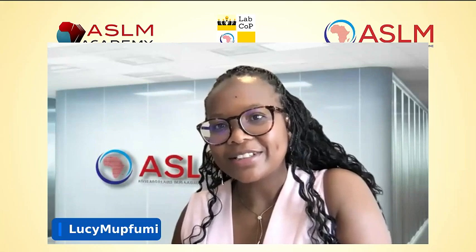Dr. Bony? Sorry, can you repeat the question, Lucy? Yeah, it was a follow-up on the issue around costs. The person is asking if it's possible to use ONT, the Oxford Nanopore, since it has been said to be more cost effective to reduce the cost.